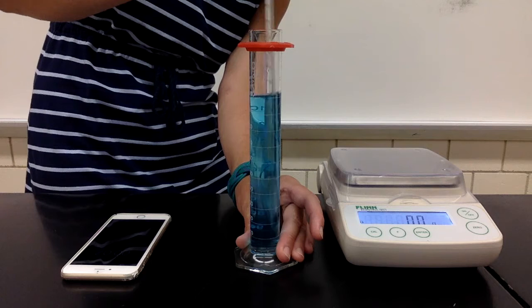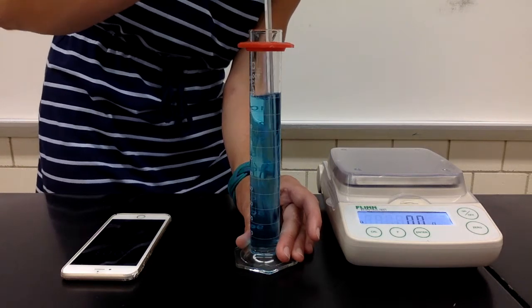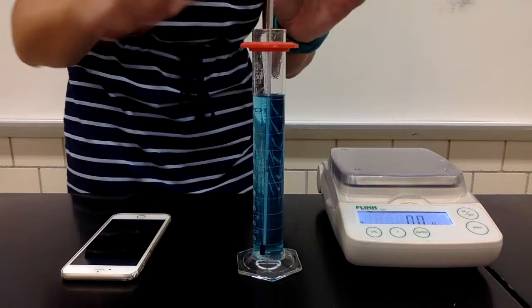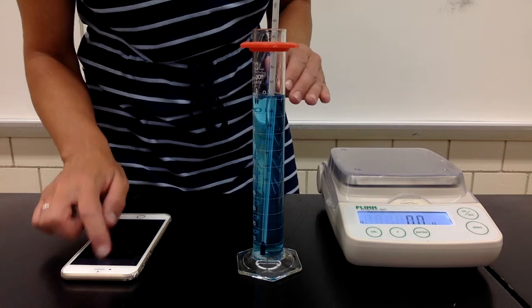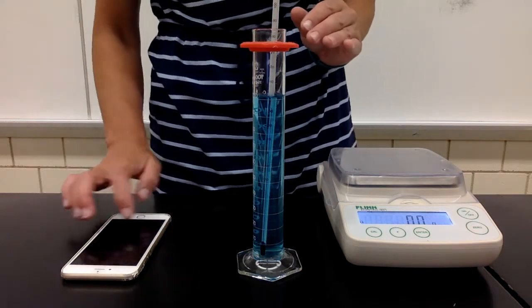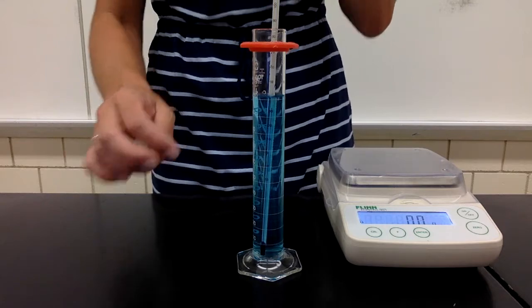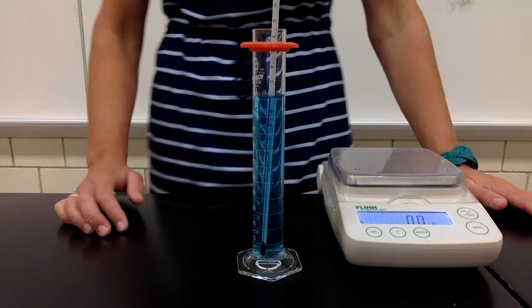Okay, it's definitely looking more clear and more uniform, as if it's mixed completely. You can still see a few bubbles in there, and the timer is off. Stop. Okay, so now it's time to take our measurements. I'm going to measure volume, temperature, and mass again.